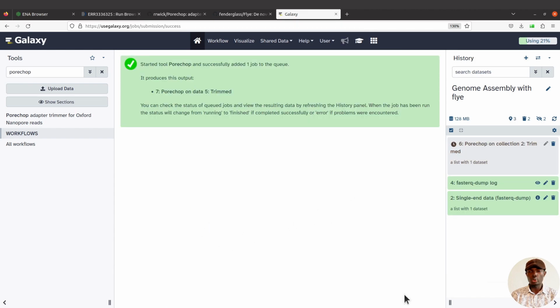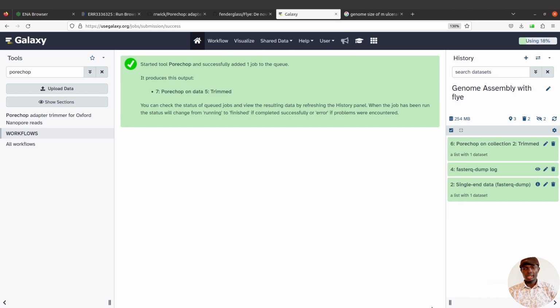So what we will have to do is to wait for PoreChop to complete its work. So let's do that and then we can proceed. Okay, PoreChop has completed its work. So we have the output here.